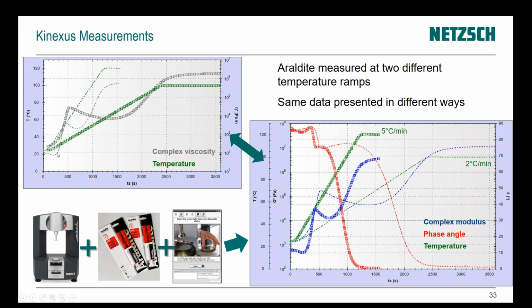So as the temperature increases, and this is where we probably get the 5 minutes curing time, you can see relatively quickly there's a rapid transition until the temperature actually starts to decrease the viscosity of the material. It's basically heating up the material until we then approach the final cure, relatively rapid against time, and then it starts to plateau out.